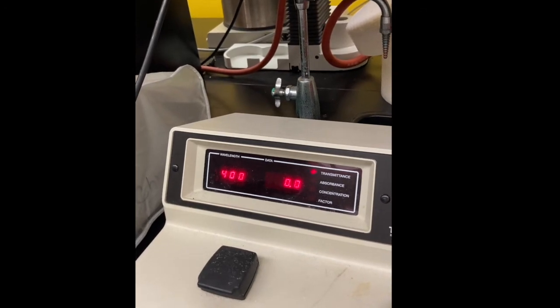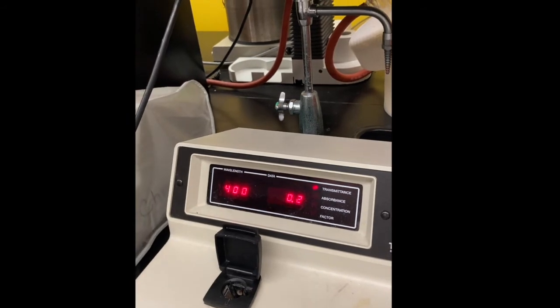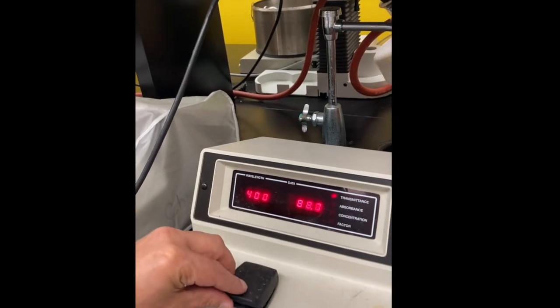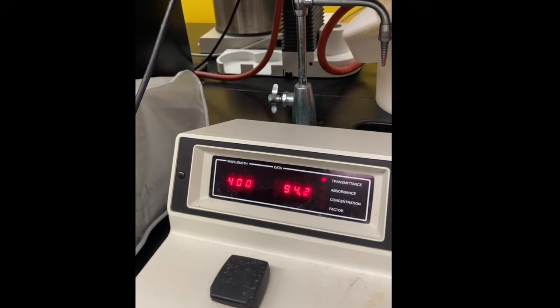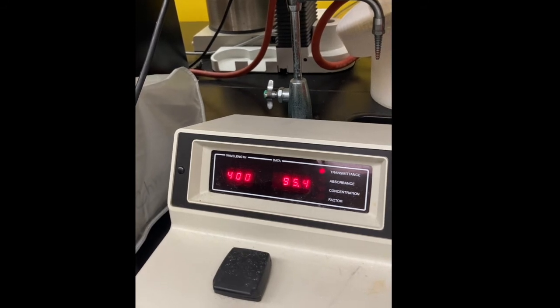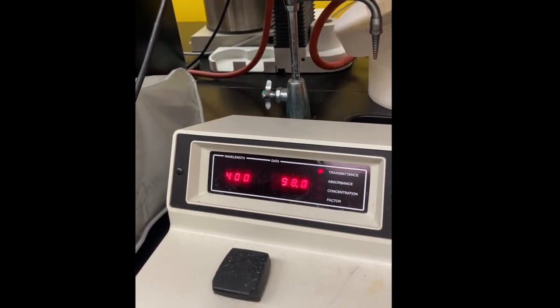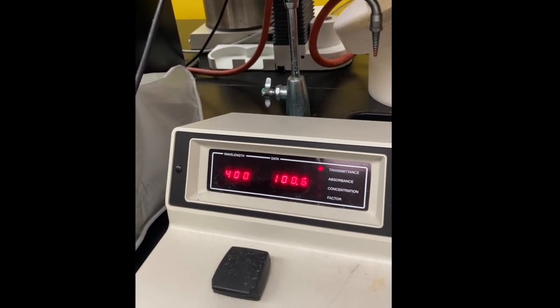And then we will need to insert the blank. This is deionized water. And here, if we are in transmittance mode, we need to set transmittance to 100%.